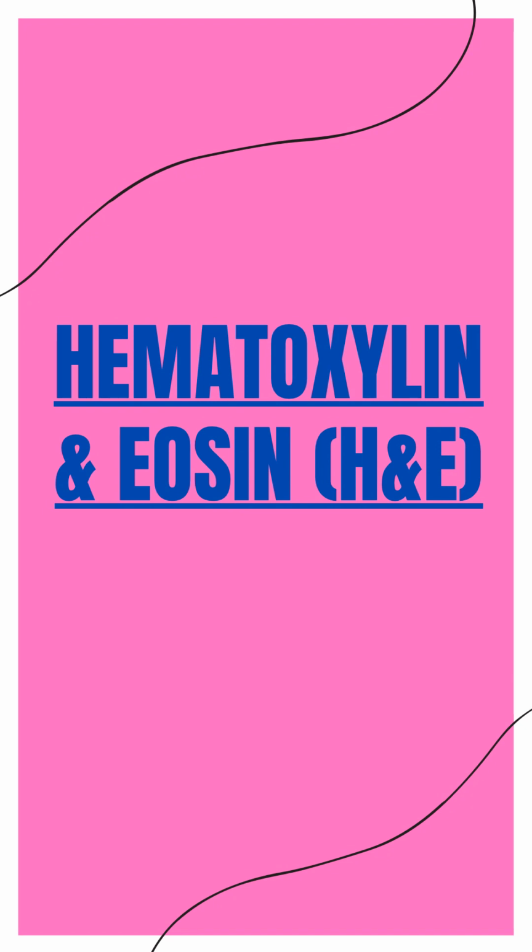The H&E stain imparts specific staining patterns to different cellular components, aiding pathologists in identifying and diagnosing various tissue types and pathological conditions. The characteristic staining patterns are as follows. 1. Nuclei. The nuclei of cells stain deep blue or purple due to the affinity of hematoxylin to chromatin, the genetic material present in the cell nucleus.